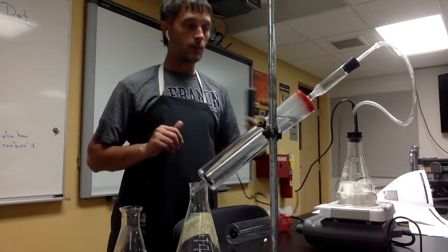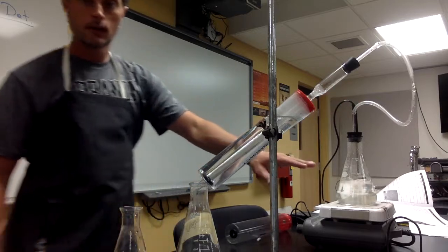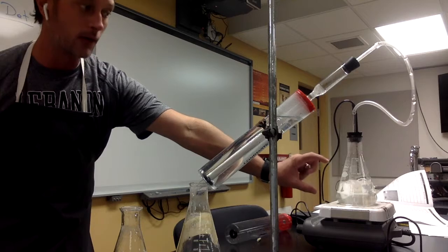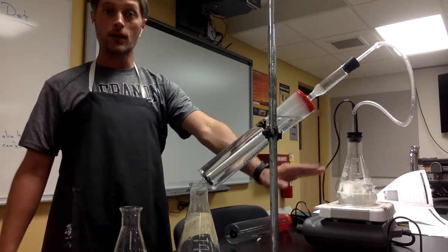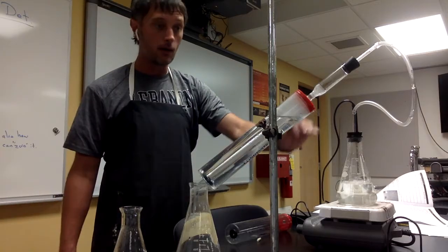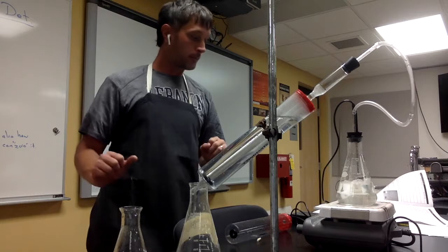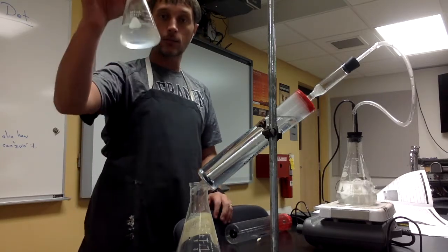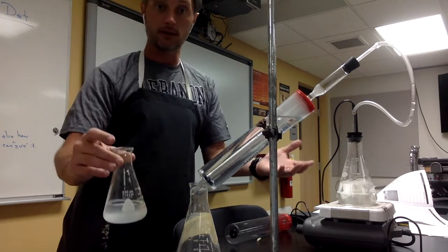I've got my temperature probe here that's measuring the temperature just above the liquid. If you notice, my temperature probe has come out of the liquid, so that's an issue. I'm not getting exactly the measurement of the liquid. I'm getting a measurement of the energy in the air above the liquid, so that's a problem. But I am confident that this is a pure liquid because it stopped boiling.